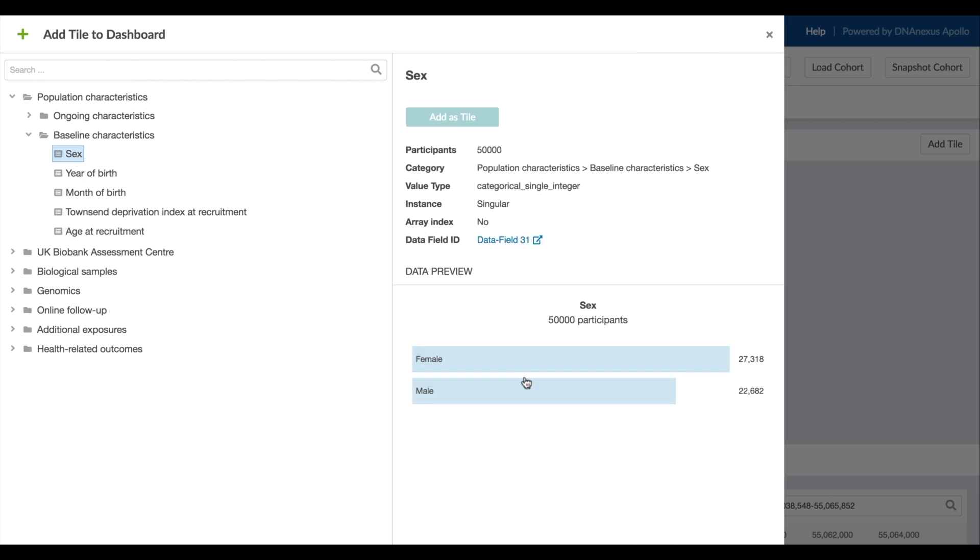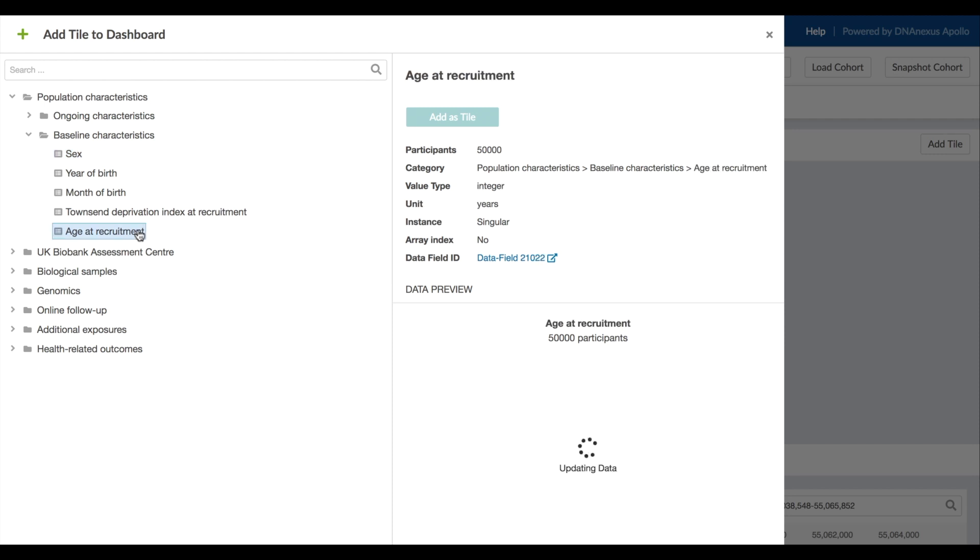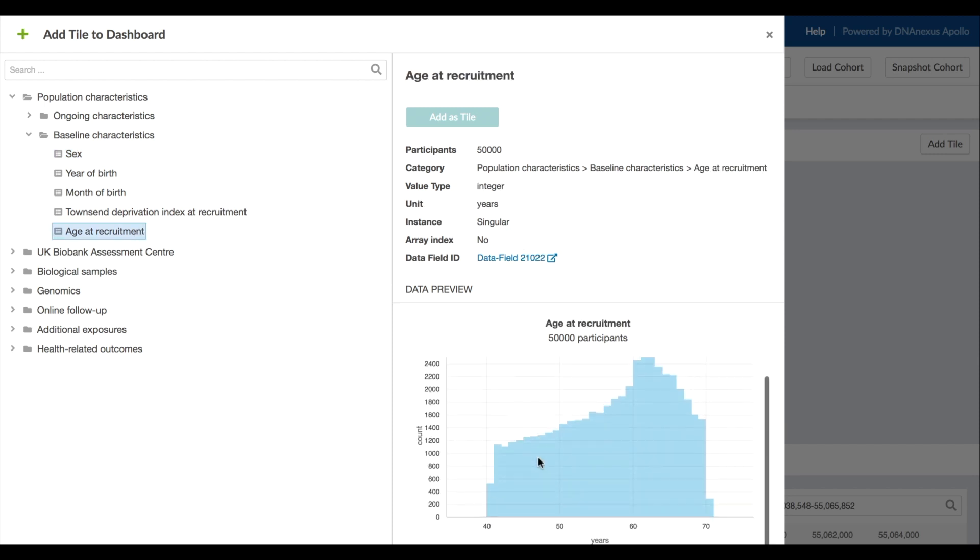We can see field metadata including the distribution of values in the full data set. Similarly for age at recruitment. Since age is a number, we see the distribution as a histogram.